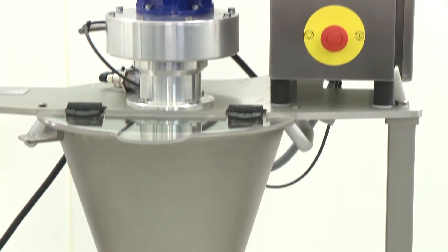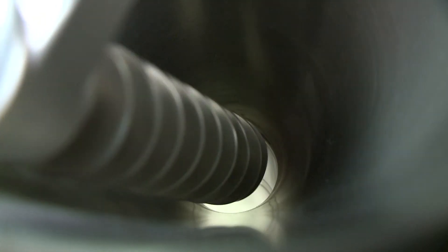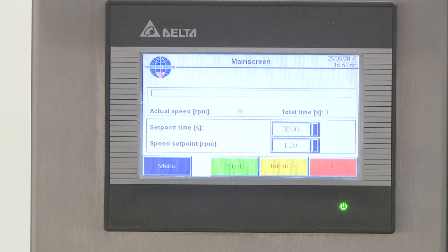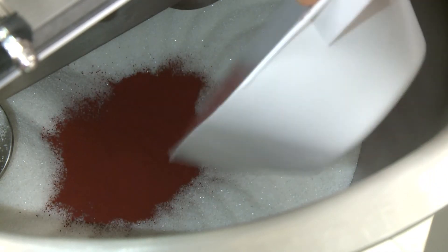This is our 5-liter model. The mini-mix is also available in 10 and 20-liter models. On top is the drive unit which powers the orbital arm and the mixing screw. The manual operated bulb valve at the bottom allows for easy discharge of the mixed products. The control panel offers full control, a PLC and a frequency converter. To show how the mixing process works, we're going to mix sugar with iron oxide.